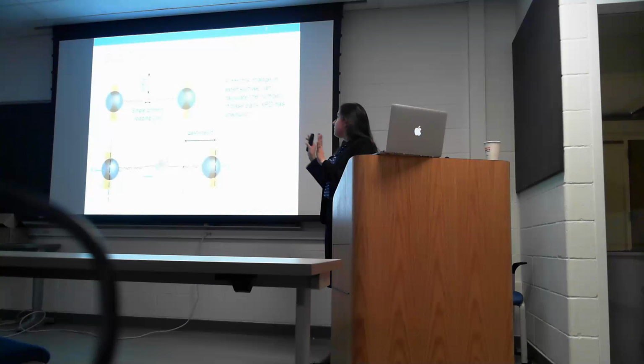By tracking that change in extension, we can calculate the number of base pairs that XPD unwinds over time. So that's what all the data I'm going to show you is mostly, this base pairs per time that XPD unwinds.